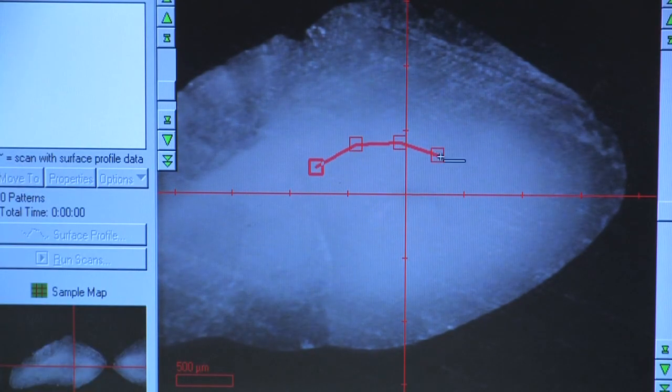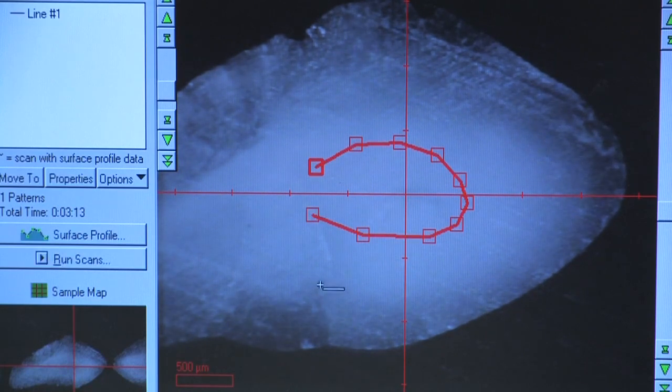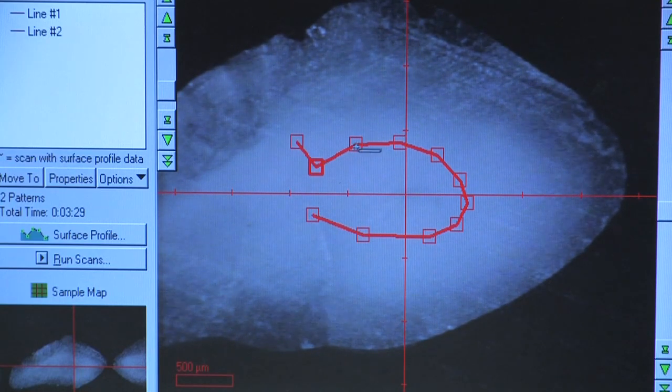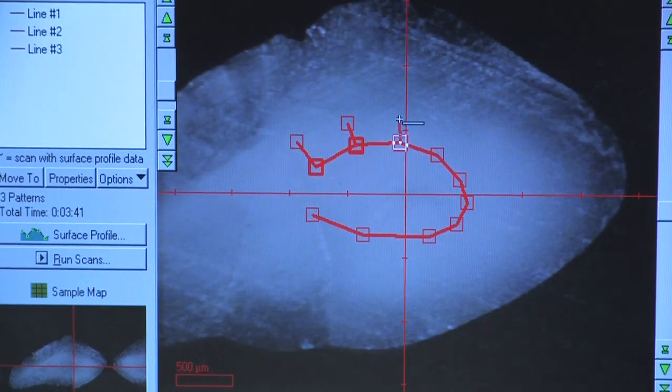When working with small otoliths, attempting to mill out a small core or one or more individual annuli can be challenging, but with a few extra steps you can ensure that you get an accurate sample. In most cases with small otoliths, the drill bit is much larger than the sample or annuli you wish to mill and almost always you will be collecting powder only from your sample, no visible pieces. These microsamples can be collected after the first sample is first coarsely milled around the area you are sampling to expose the actual sample. This procedure is similar to that described in Worcester et al. 1999.